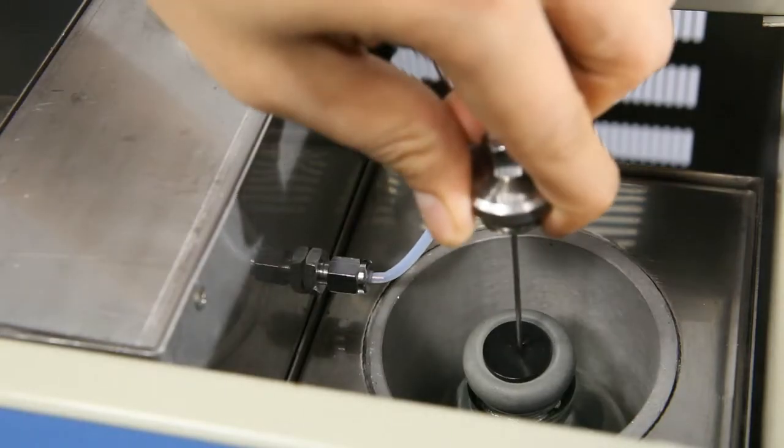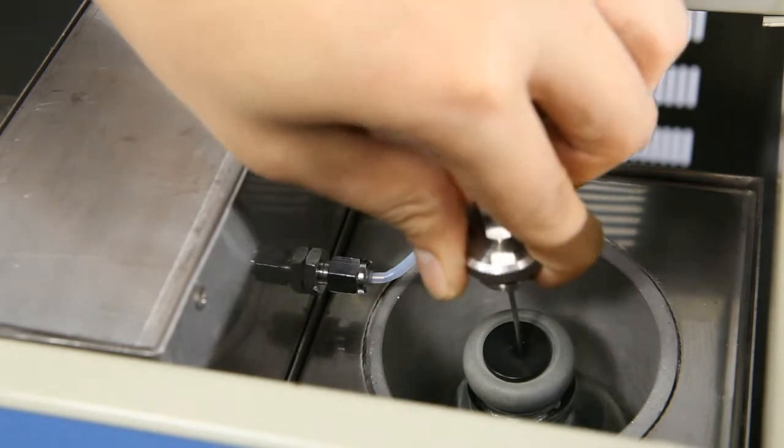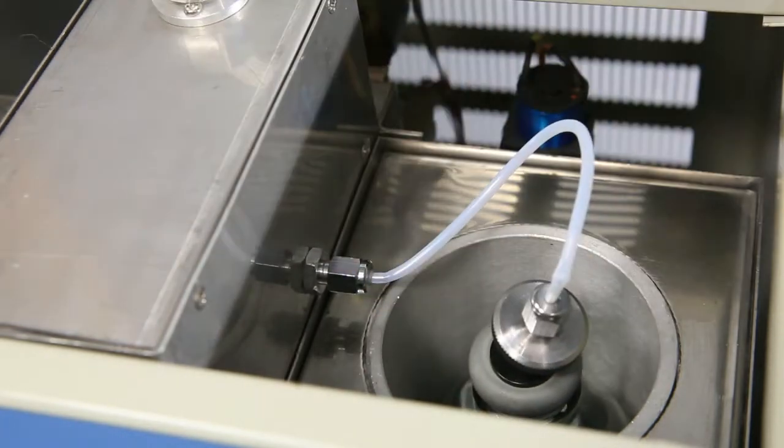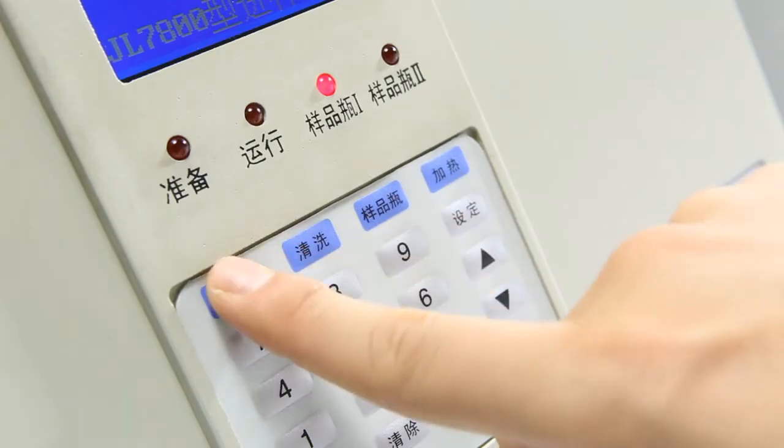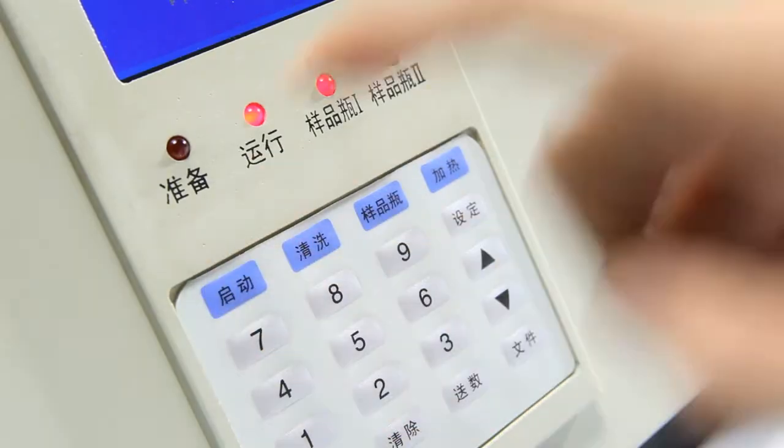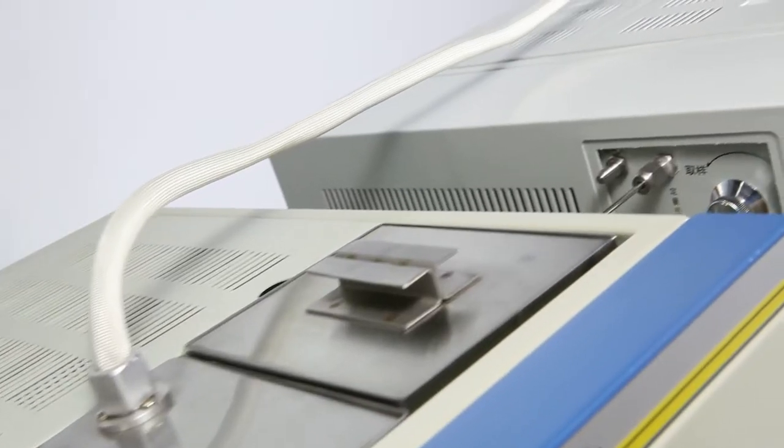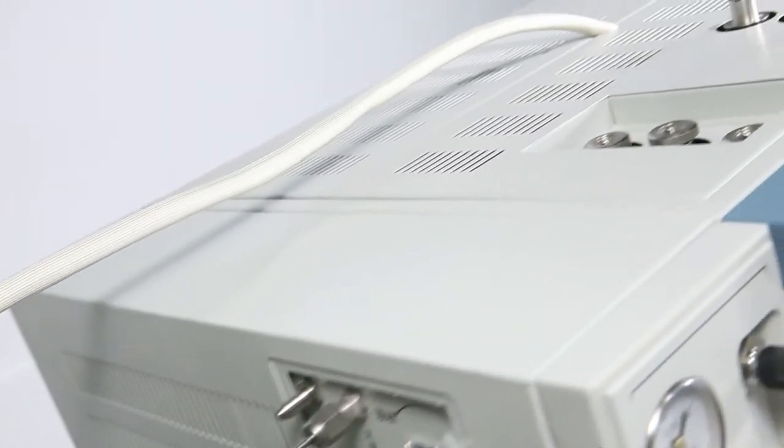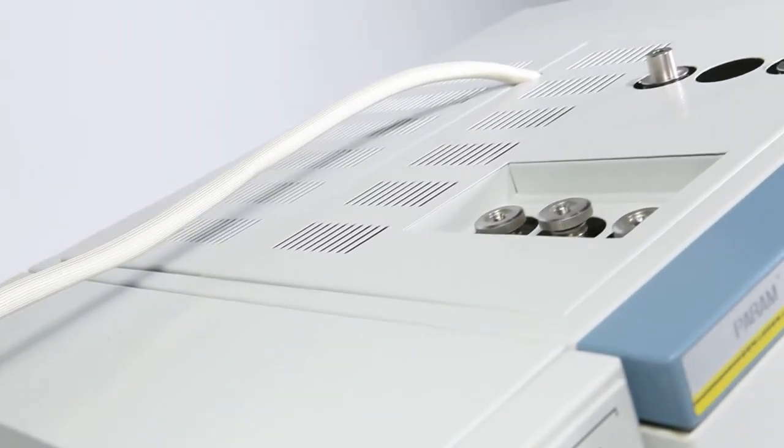Users only need to insert the sampling needle into the headspace bottle. Press start, the system will then accomplish the sample injection and analysis automatically.